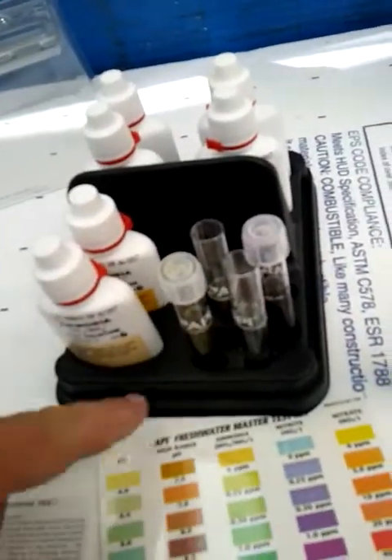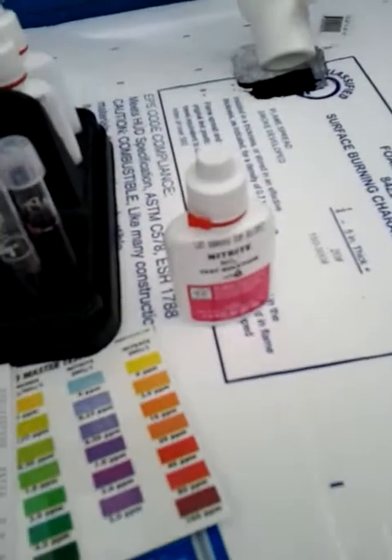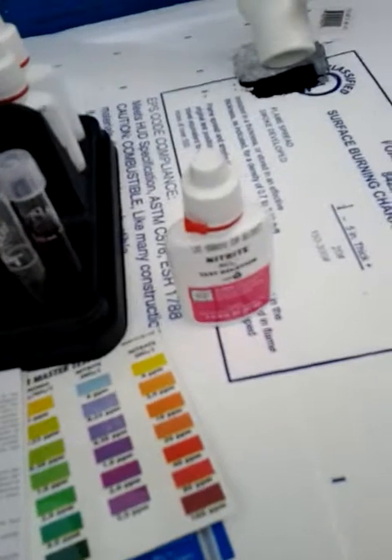I'm going to do the nitrite test right here since it's just one test. I'm sitting here reading the instructions — it tells you right on the bottle: add 8 drops of this, 8 drops of that. The nitrite test says 5 ml water, 5 drops, 5 seconds, and wait 5 minutes for the color to develop. So I'll get that one going and we'll update the video for both of those.